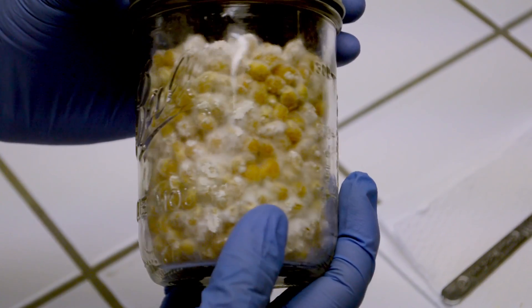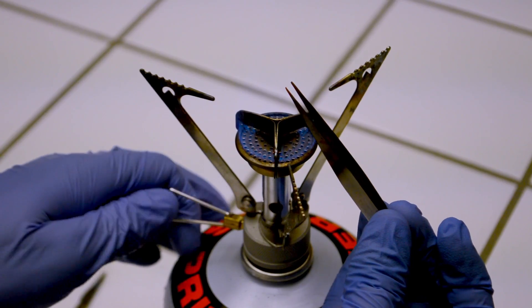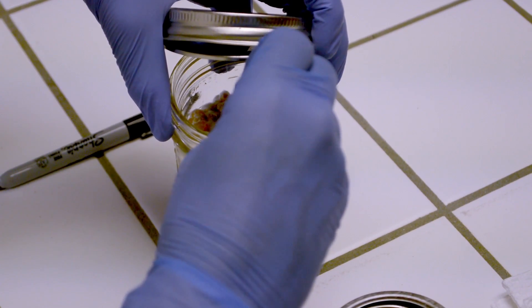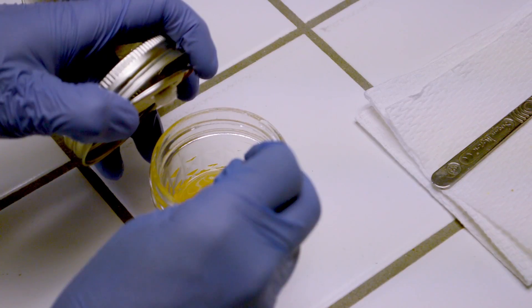The final technique we will outline is the grain transfer method. This is one of the simplest techniques, involving the fewest steps, provided you have a jar of colonized grain. To do this, flame sterilize a pair of tweezers then allow it to cool. Then crack open a lid of grain culture and pluck out a piece — a single grain or kernel is all that's necessary. Then take that piece and place it onto the center of the agar, then seal and store for incubation.